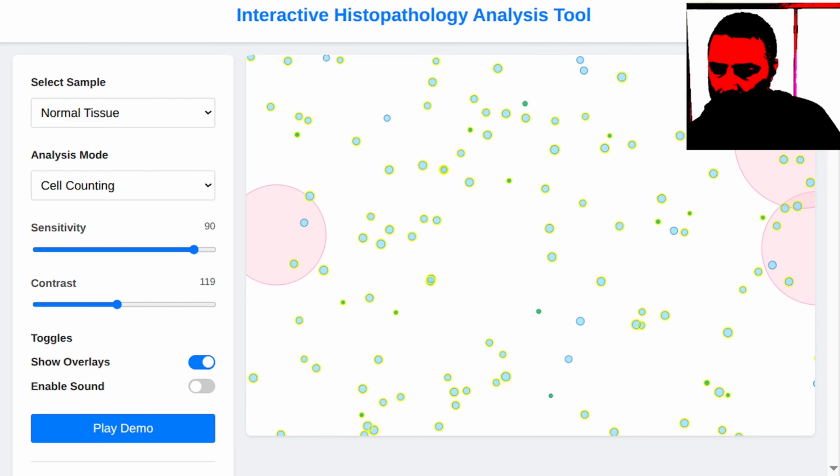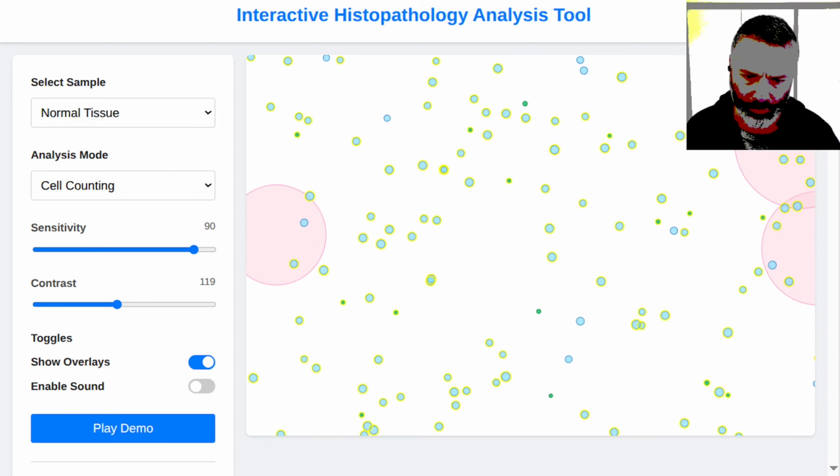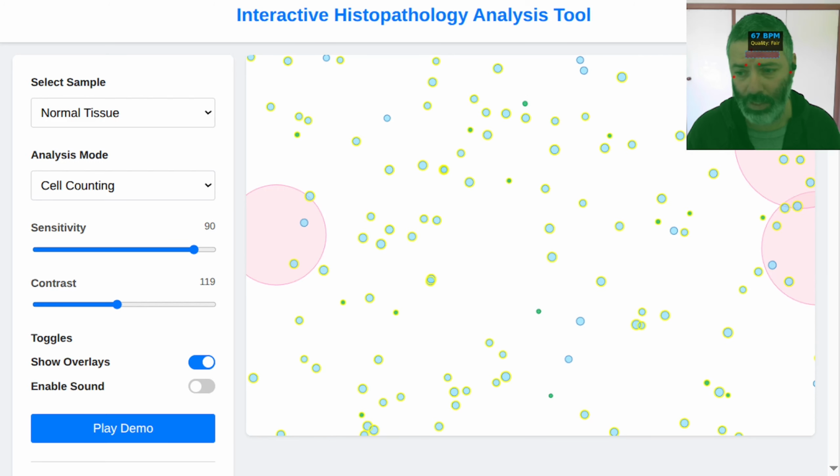Gemini stuffed up my code. No, the demo mode should be starting automatically as it was before. Yeah, and if we can check for any other errors, that will be good too. Yeah, that'll probably be the last prompt. It's going to regenerate the code. Didn't understand demo mode auto start.